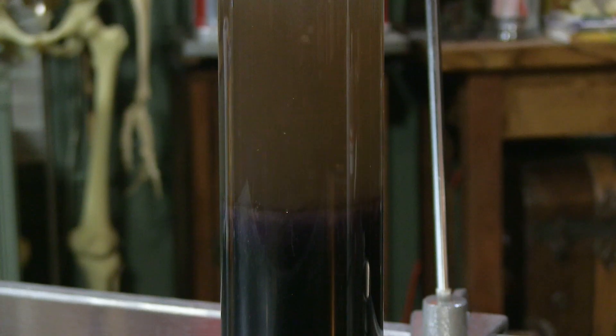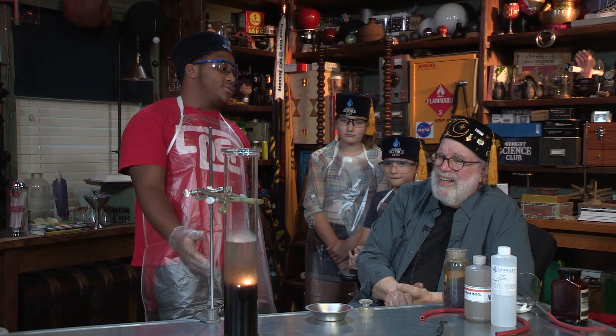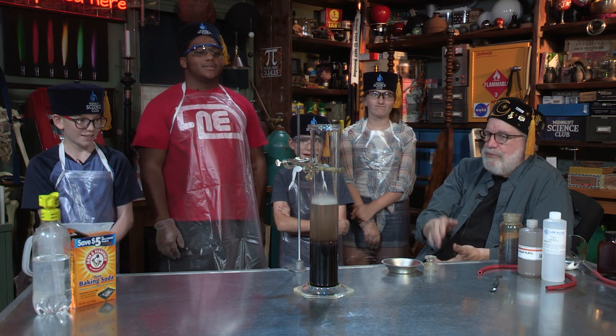Looks like a battlefield or something, isn't it? I would say that the alcohol is definitely meeting the acid right now. That's just kind of getting dirtied up — that's all the permanganate. We're just enjoying this. Isn't this a beautiful chemical reaction?